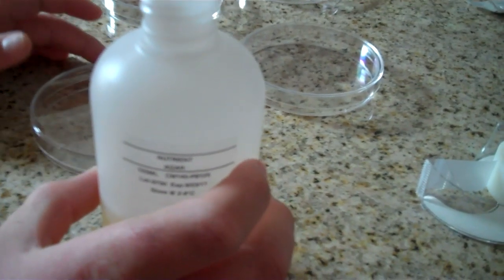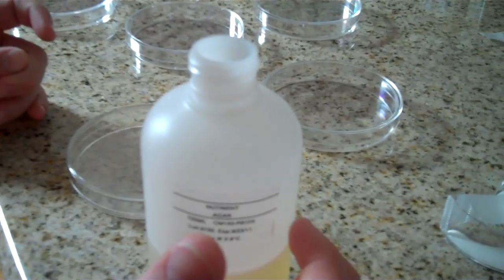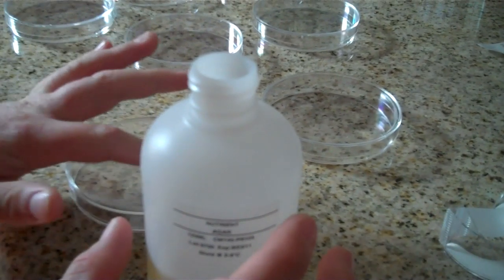The liquid is boiling. Slide open the cover just enough to pour the liquid nutrient agar in. Pour 10 to 13 milliliters of agar into the dish, enough to cover half to two thirds of the dish. Don't let the bottle mouth touch the rim of the petri dish.